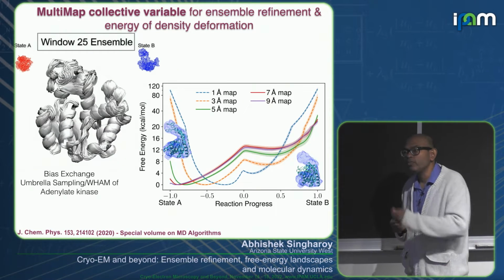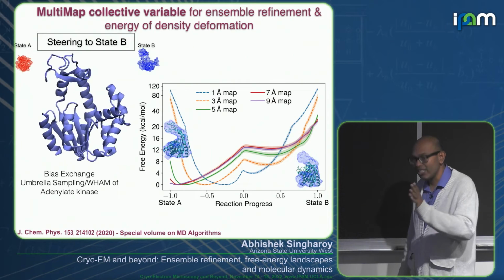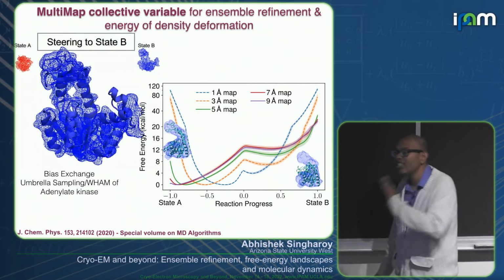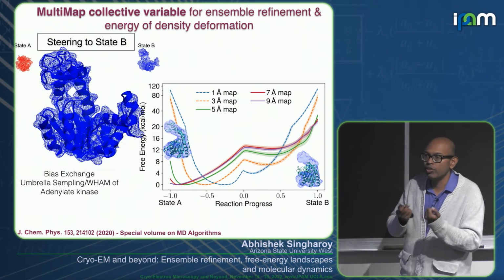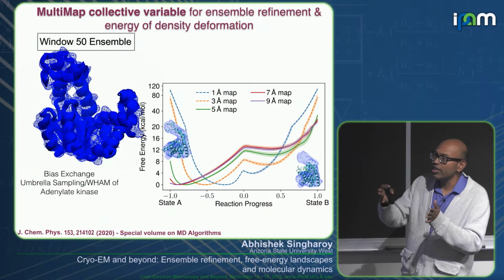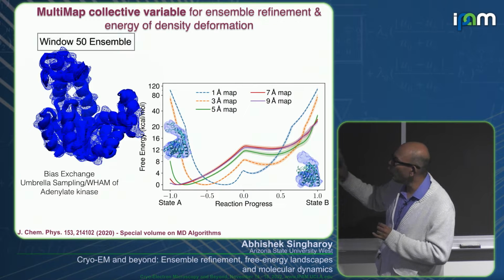So now I can do the following. All the machine learning maps that are being created, I can figure out the energy difference of those map deformations and tell whether this is thermally accessible or not. Is this really dynamics, or is this biologically relevant? Because of course you can have a lot of deformations, but that does not mean there is any biological relevance to it. But if you can figure out the energy difference between these, then you can say that this is possible at room temperature. So that's actually the first way forward that we had.